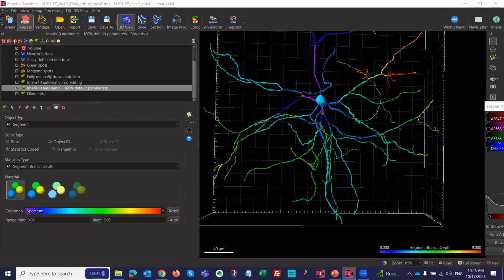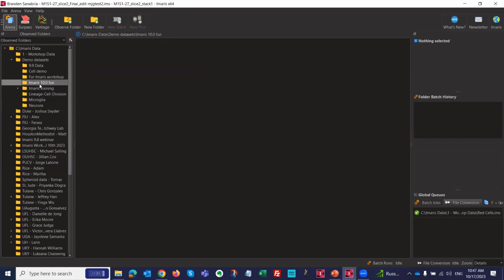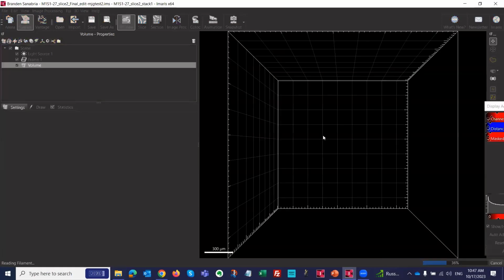So I did want to show you this light sheet data set here, which is a vasculature already done. Where is it? Oh no, it's here. This one, light sheet. It's cropped as well, so it's not super large. It's just 13 gigabytes, but it's still large.